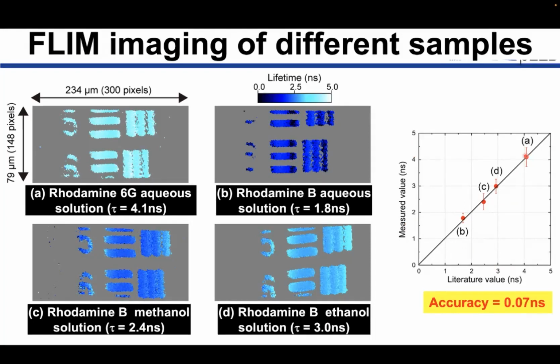Then we performed curve fitting analysis with a linear function, like here. So a good relationship was confirmed for this sample.